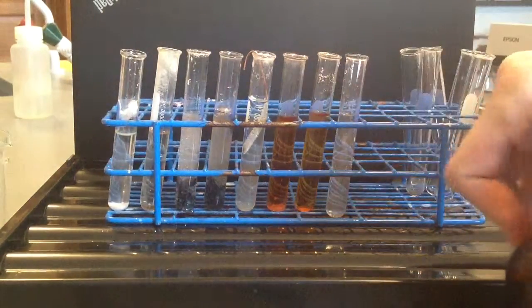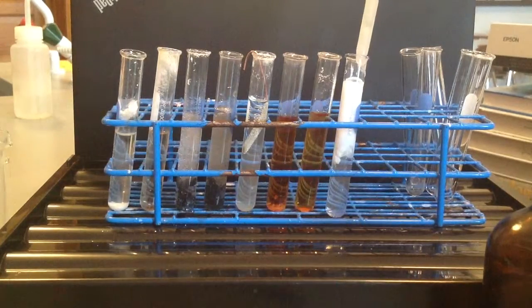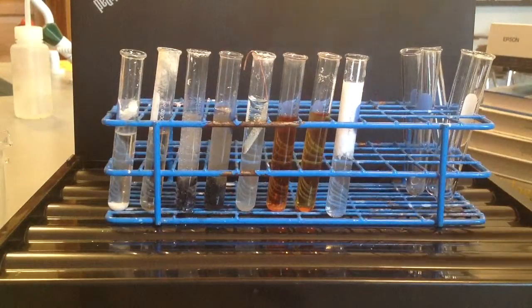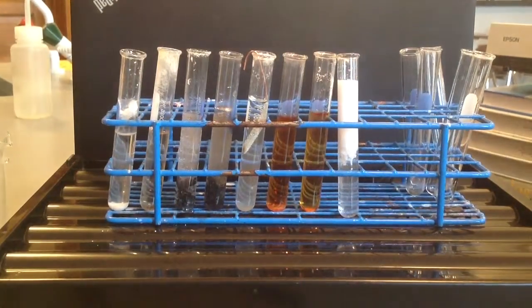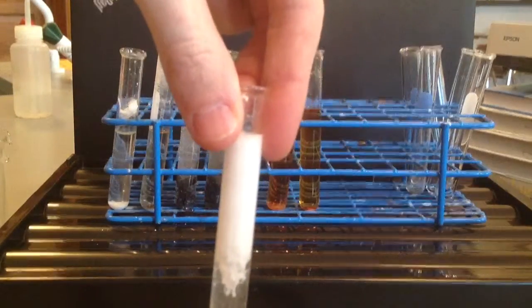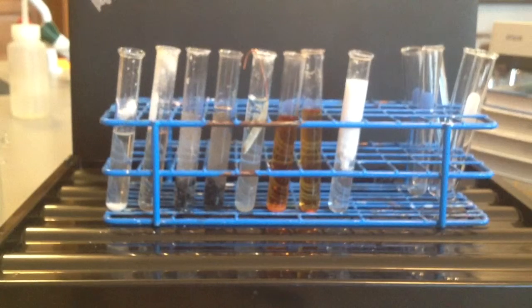So here's the sodium chloride solution. Little shake. Although you can see that there's some pretty obvious things going on there. Bring that in a little bit closer for you to look at. Okay. So that is step 7, the part where you put the silver nitrate and the sodium chloride together.